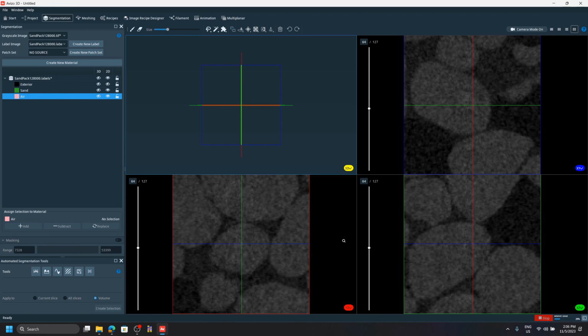All right, so as I said, we don't want to do manual segmentation, right? And that's why on the lower left, you have your different segmentation tools, right? And you have here thresholding, which is exactly the same as the thresholding tool we had before. We have other things like watershed, texture, classification, and the AI assisted segmentation, which we will focus on in a little bit, right? But for now, I just want to show the simple one, which is thresholding.